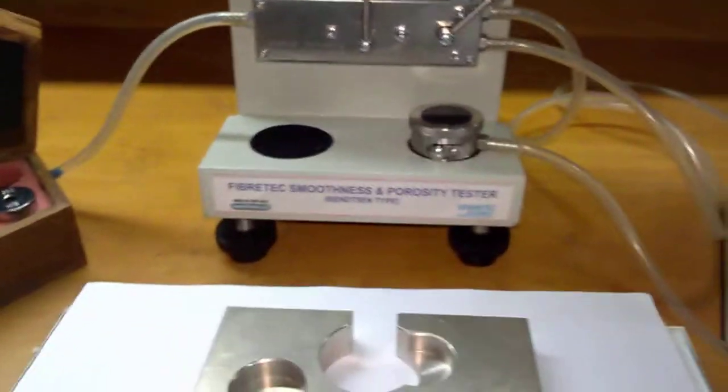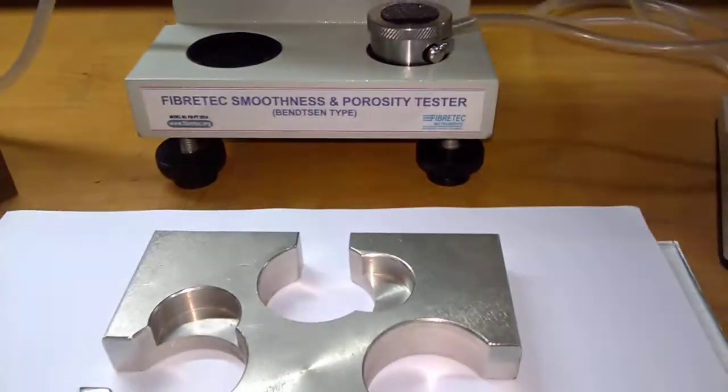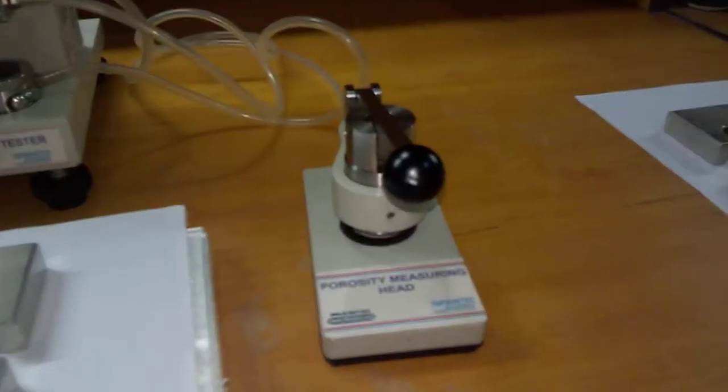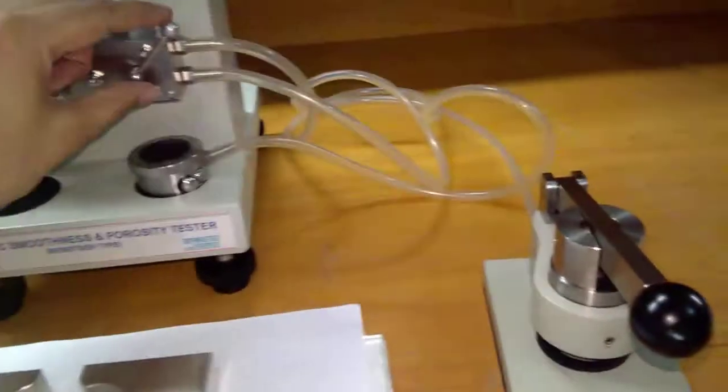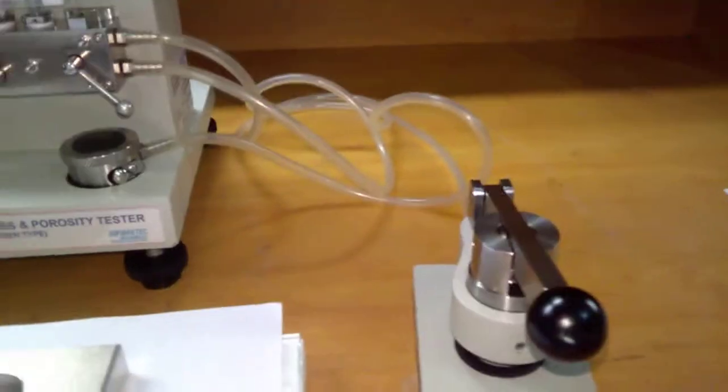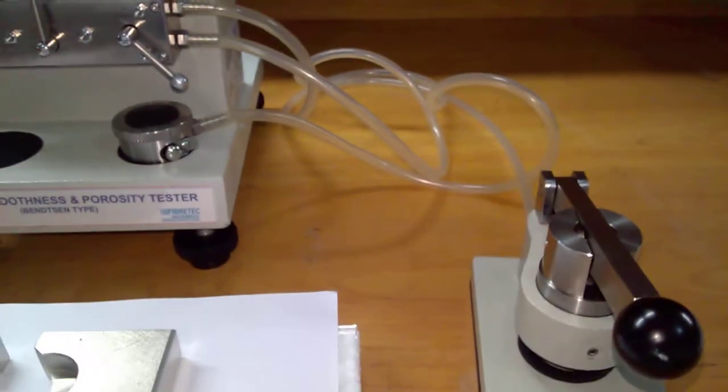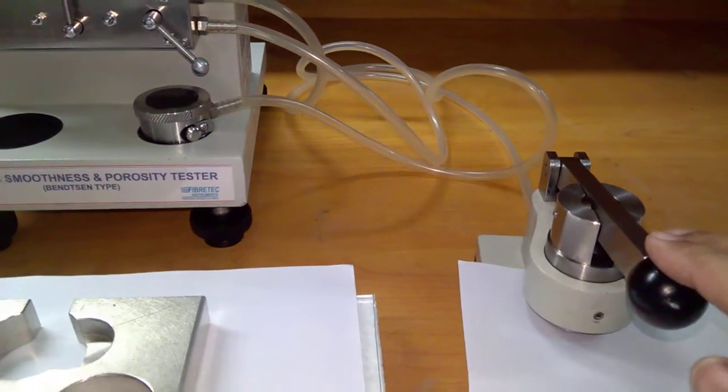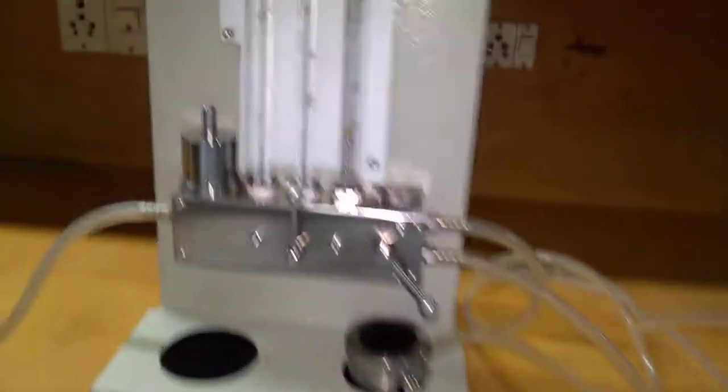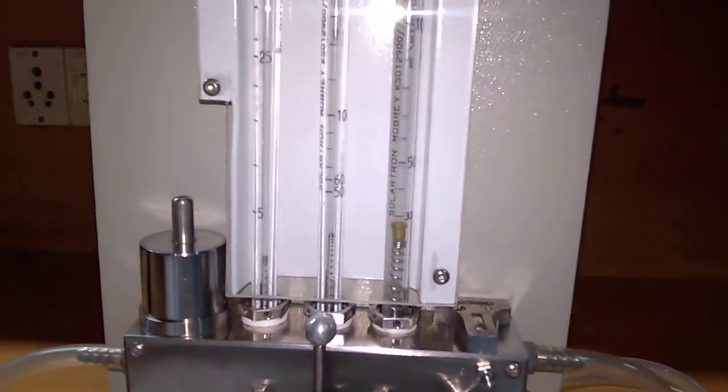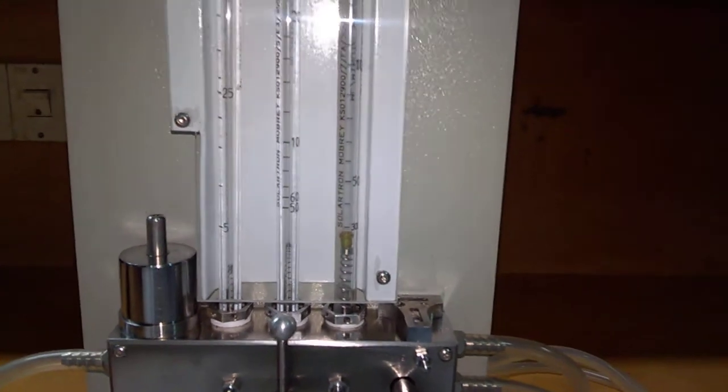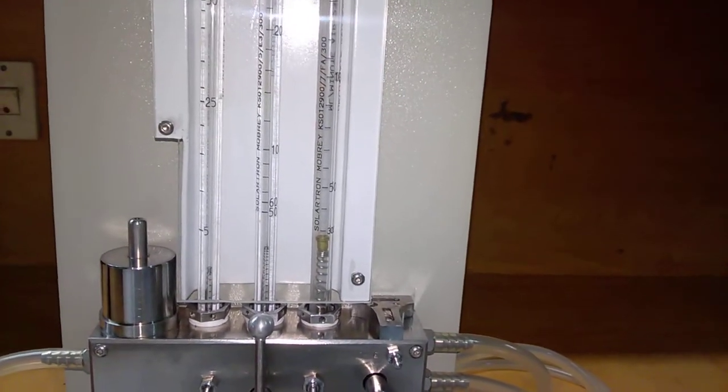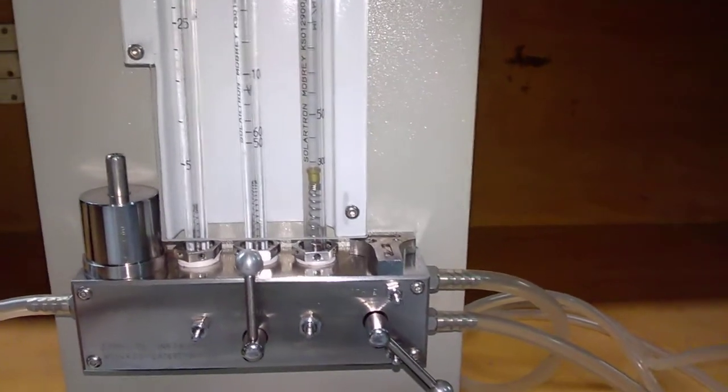When we have to measure the porosity, we use this particular head. Change the knob to the porosity position. Insert a paper here. It gives the porosity to be 140, 160.